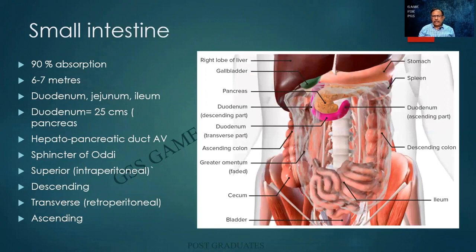Again, the abdomen is a temple of surprises. Look at what is over here. And my Professor Cooper used to explain what are all the various structures. Remove them one by one. And behind that, you will be finding the kidney. You will be finding the pancreas. In fact, what are the structures forming the stomach bed? Let us go back to the small intestine without any deviation.